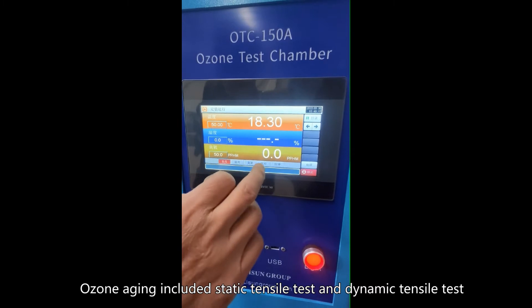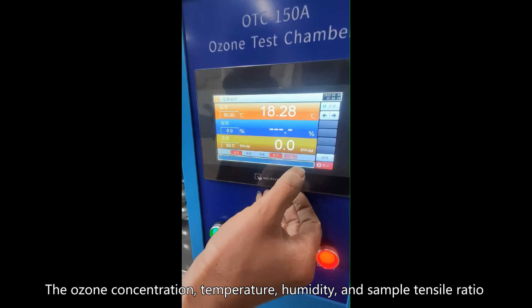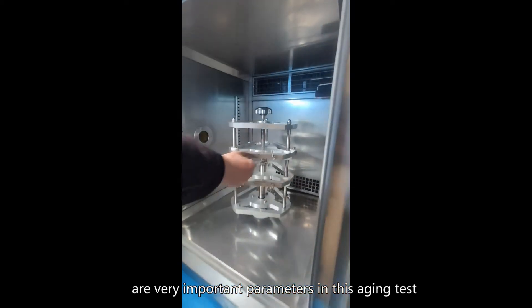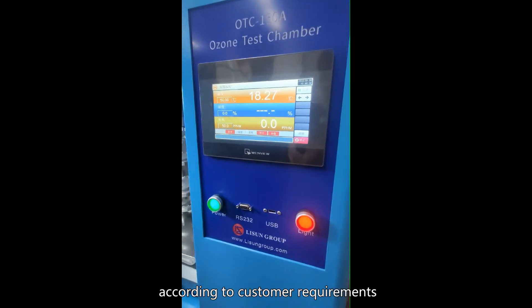Ozone aging includes static tensile test and dynamic tensile test. The ozone concentration, temperature, humidity, and sample tensile ratio are very important parameters in this aging test. The working size of the test chamber can be customized according to customer requirements.